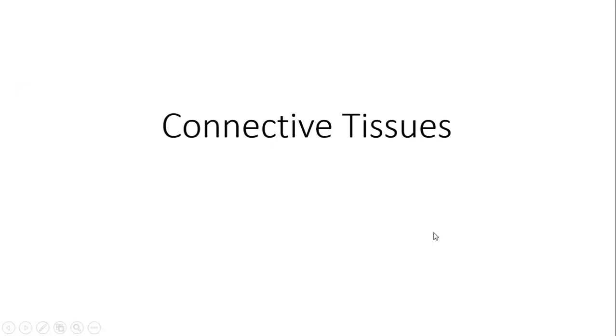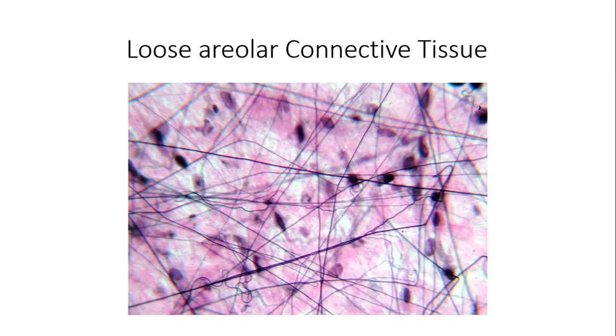We finished the epithelial tissues. This is the easier part, the connective tissues. Let's do loose areolar connective tissue first, because this is definitely the easiest.